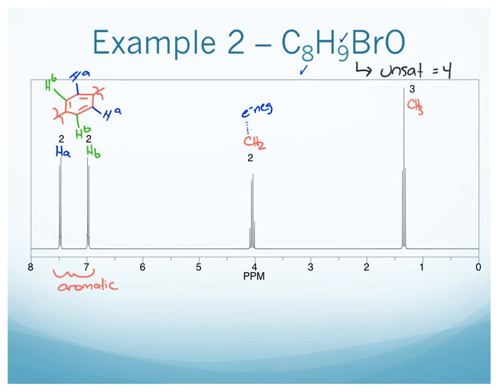But we don't have our bromine and oxygen accounted for. So that we have them as pieces to use in our structure, let's just write them here on the spectrum. And remember that bromine wants to make 1 bond. Oxygen likes to have 2 bonds. So using that information, let's connect some things together.